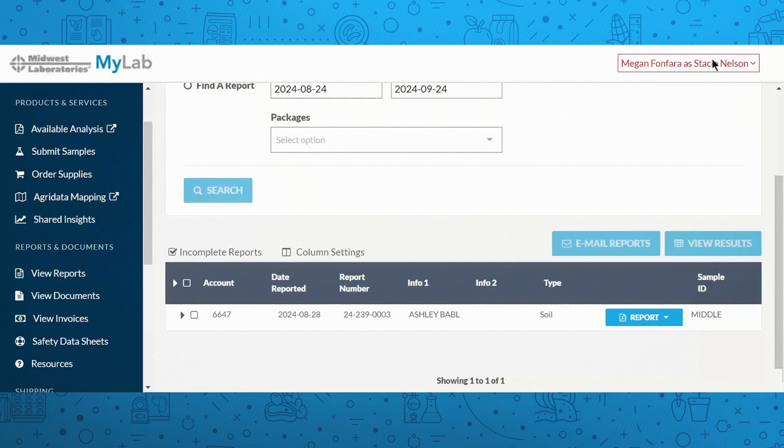Welcome to Midwest Labs. Today we are going to show you how to view your report.